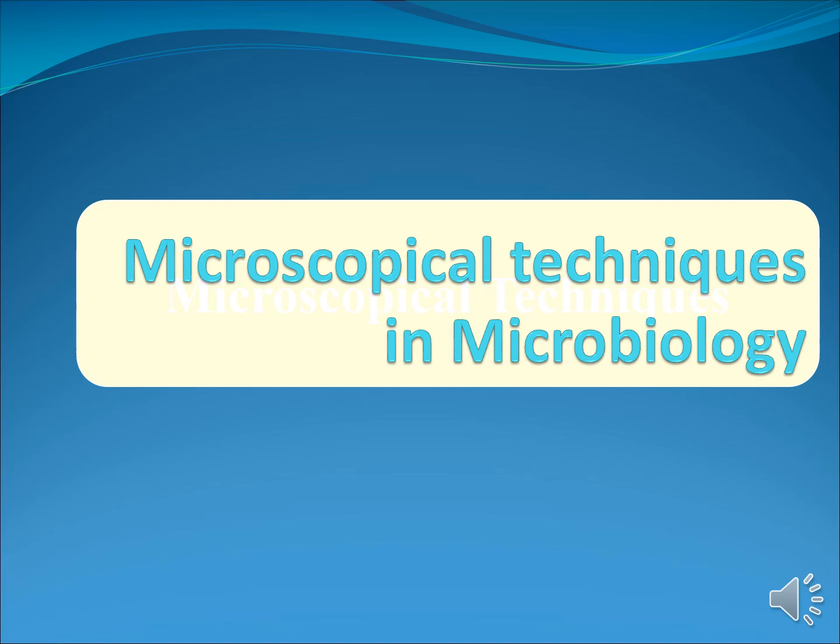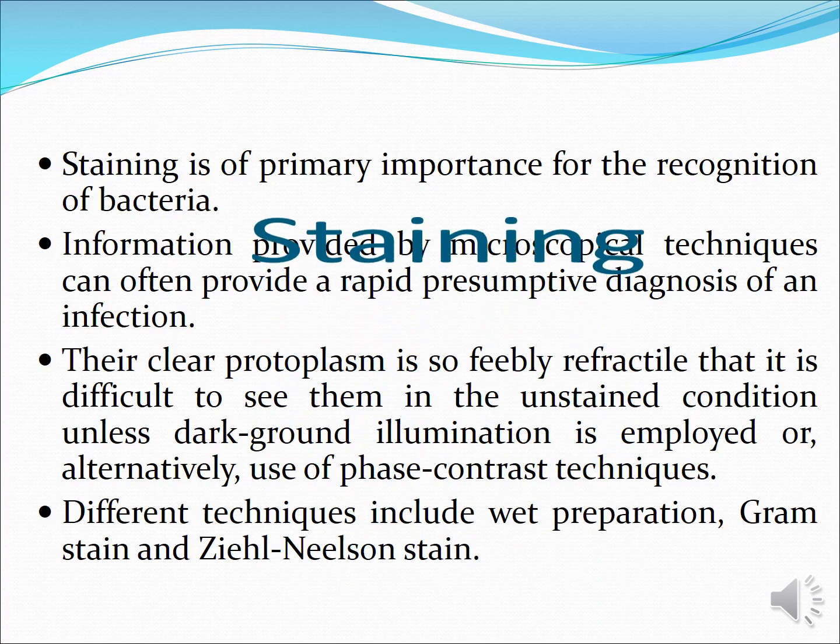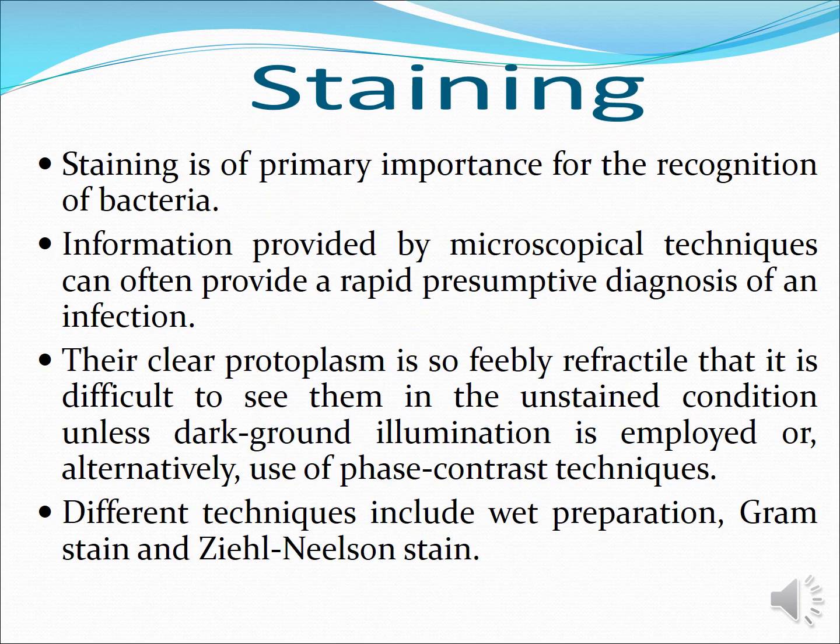Microscopical techniques in microbiology. We'll start with staining. Staining is of primary importance for the recognition of bacteria. Information provided by the microscopic techniques will often provide a rapid result for the diagnosis of an infection.